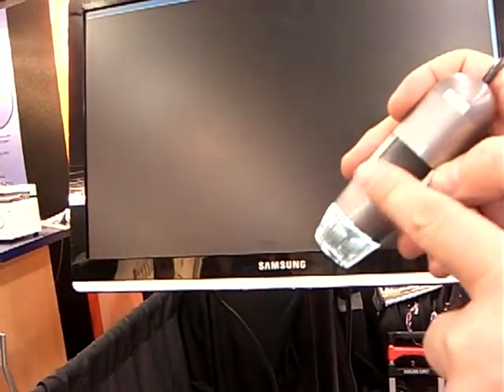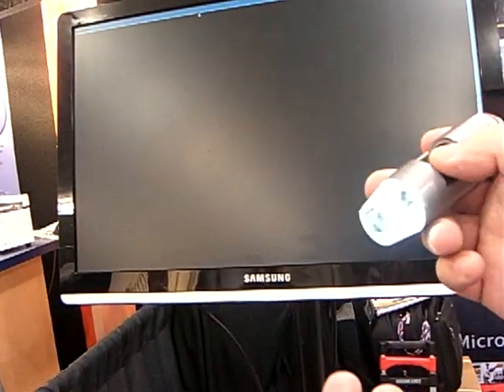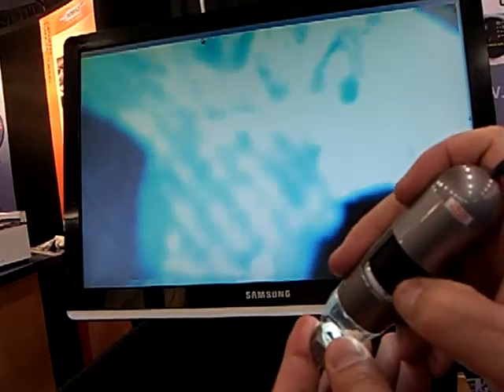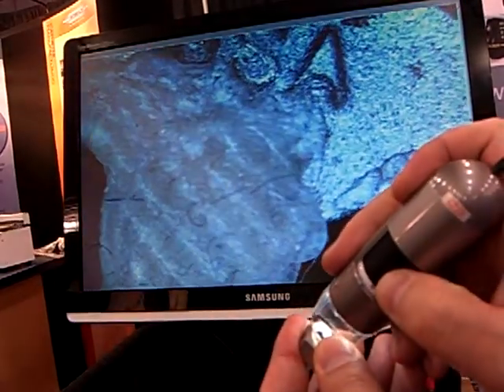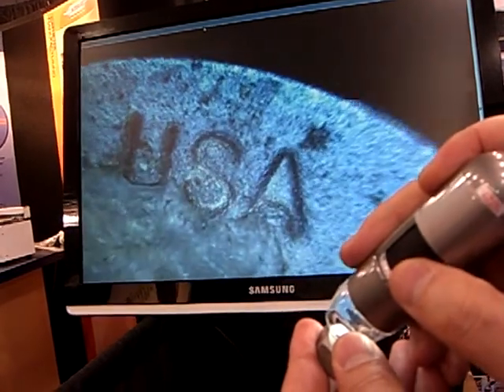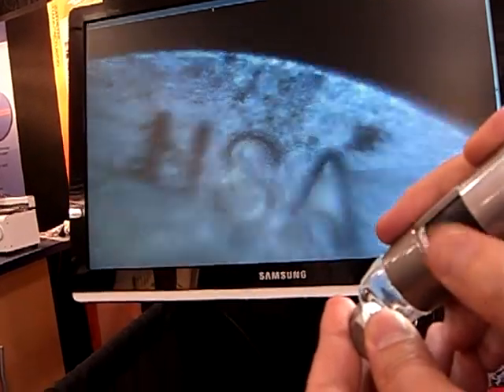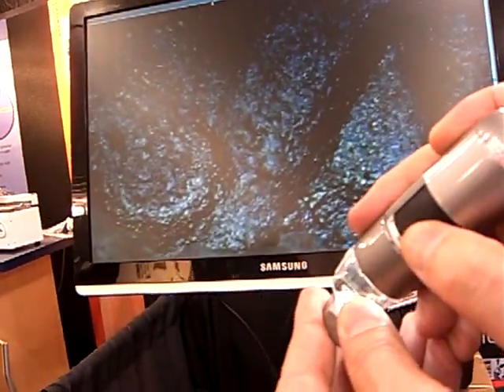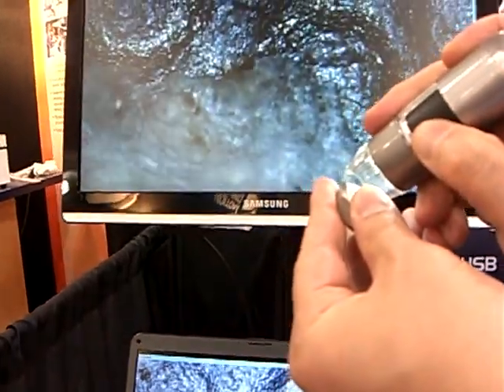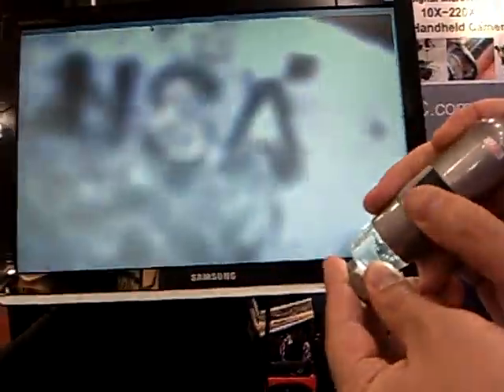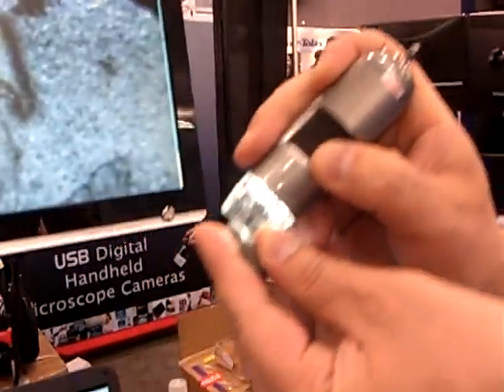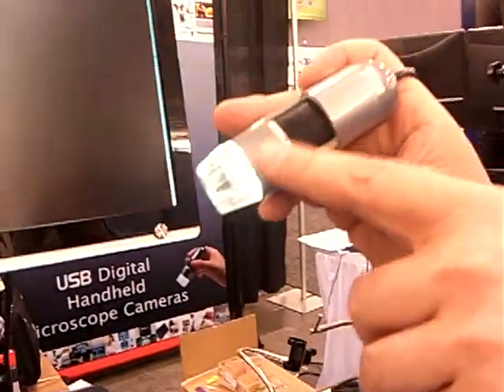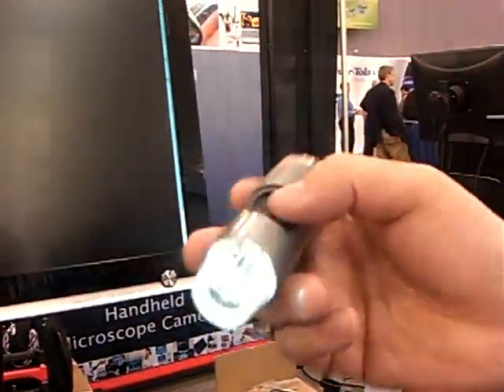Travel up and down to get different focus and locations. To see the right detail, just adjust the focus. You can zoom in more by focusing further. The lens travels up and down to get different locations.